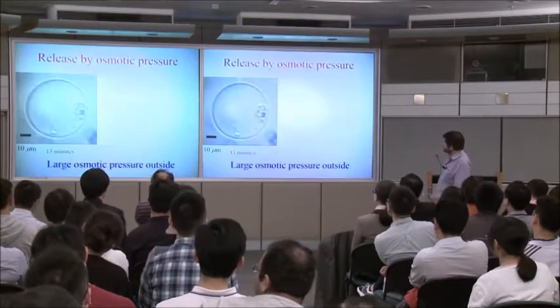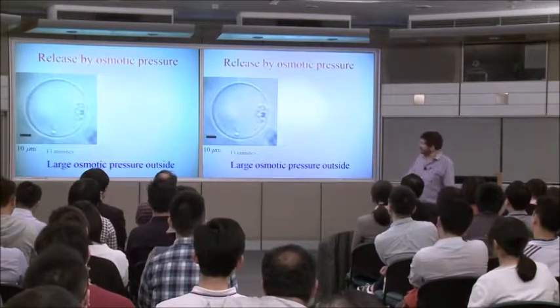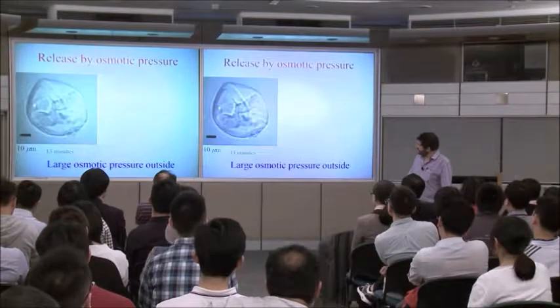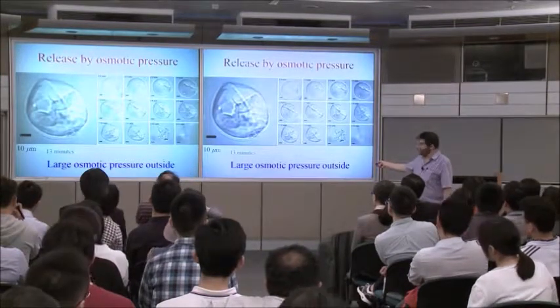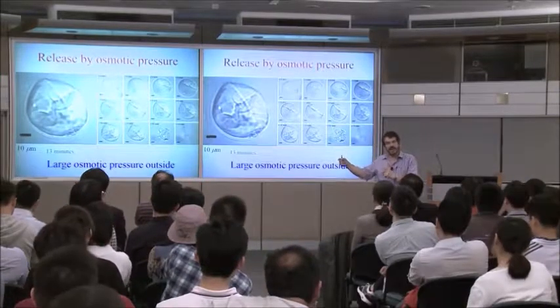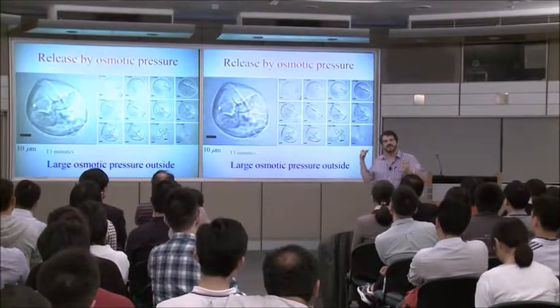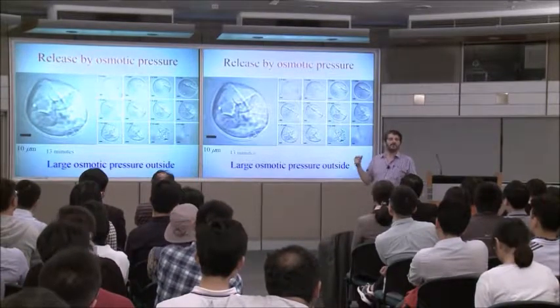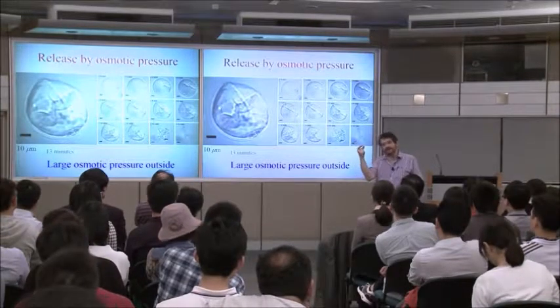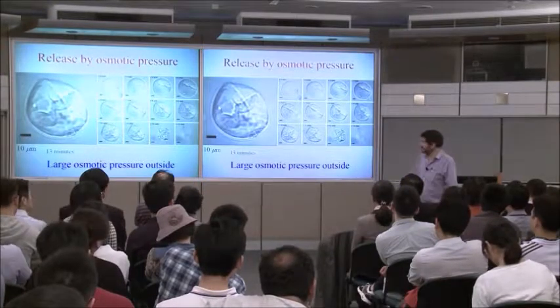So I showed you can crush it, but actually, it's sort of interesting. Let me just crush this with an osmotic pressure. So here, I'm crushing it. It gets smaller and smaller, and eventually, I crush it down to nothing. Now imagine if you're something that's on the inside. Unless it's a very, very large molecule, it's been crushed and it's been squeezed out. So what have I just showed you? I've showed you not only how to crush it, not only how to encapsulate something, but also how to release it. I squeeze it out by putting a pressure on it.